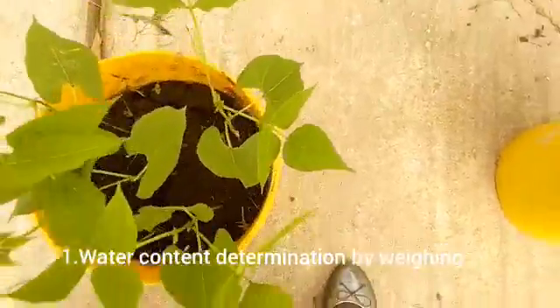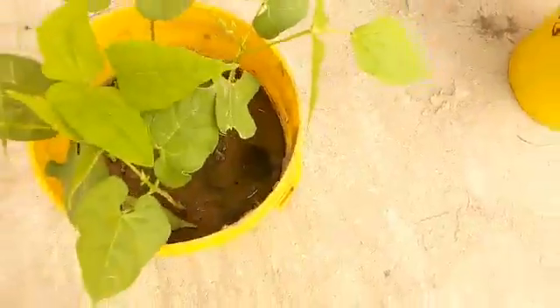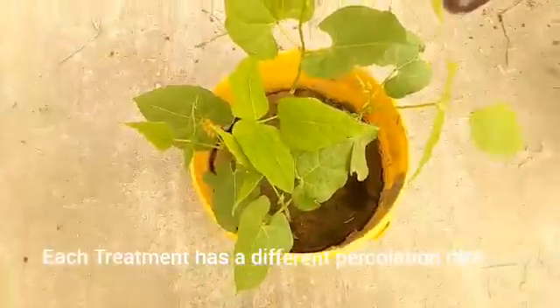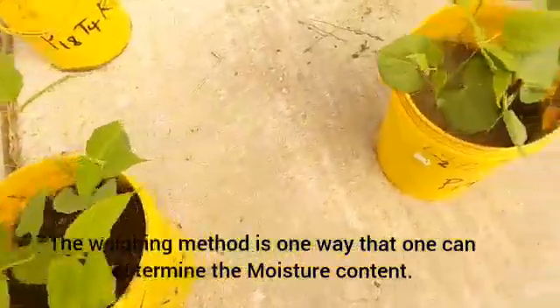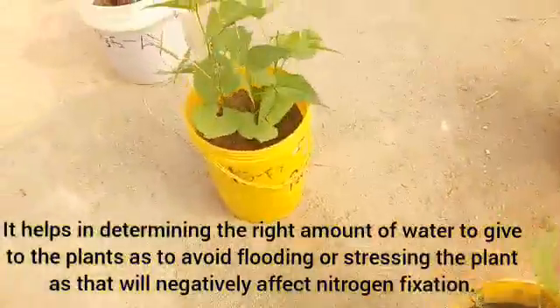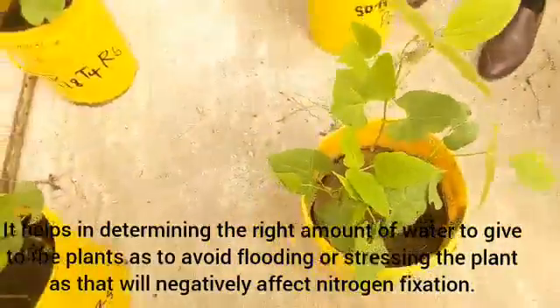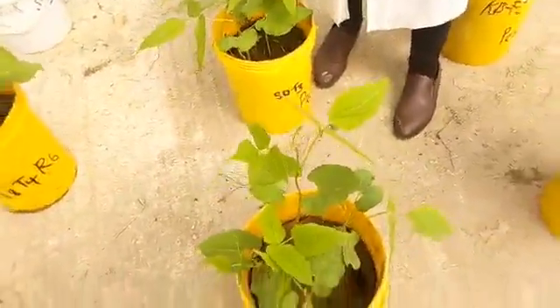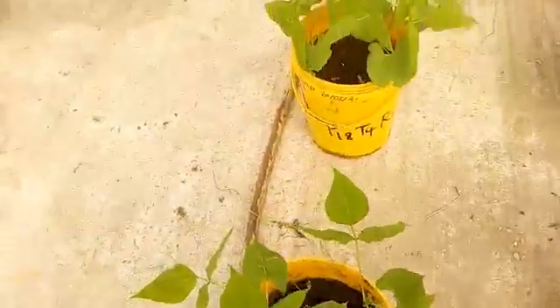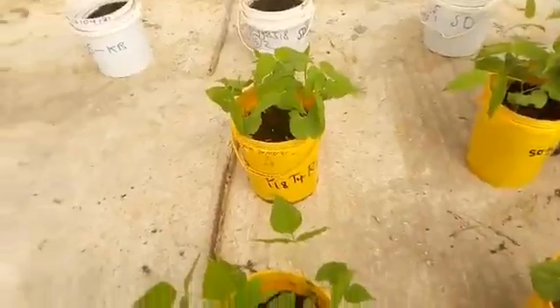be added. Okay, so on the determination of how much water the plants require, as you can see, we have different treatments. Our soil types are different, and some of them are easy percolators and others are very slow, and so they require different amounts of water. And at this stage, our plants are actively transpiring and losing a lot of water. So for us to avoid flooding, which can affect nodulation, or stressing them with low water, which will also affect nodulation, we need to determine how much water has been lost and how much is required. Since we do not have a tensiometer, what we are using to determine that is weighing the soils.